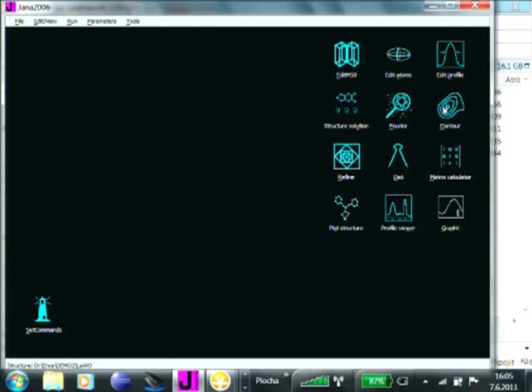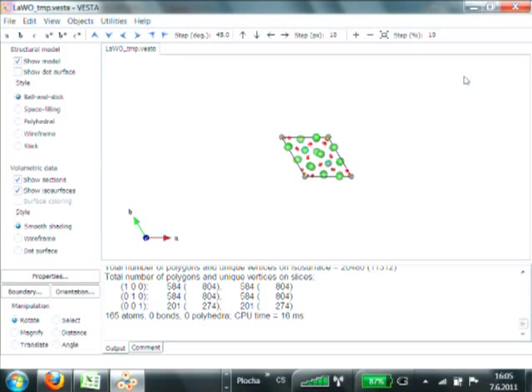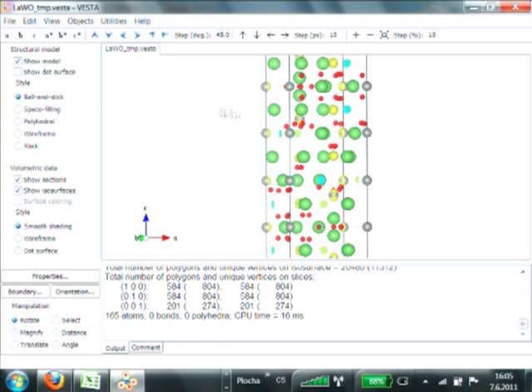And we have a solution, and again, we view the solution with Vesta in 3D. So again, you could see that there were nicely round peaks, so no problem with that. And if we zoom a little bit, the green spheres are lanthanum atoms, or peaks that were interpreted as lanthanum atoms, and the gray spheres are tungstens, red are oxygens.